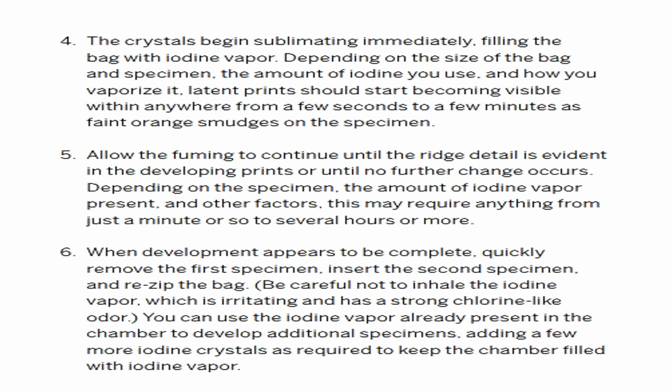See the crystals. Now what happens is the crystals begin sublimating immediately. You have to close the bag and shake it, and the crystals begin sublimating immediately, filling the bag with iodine vapor. This depends upon the size of the bag and specimen, the amount of iodine you use and how you vaporize it.